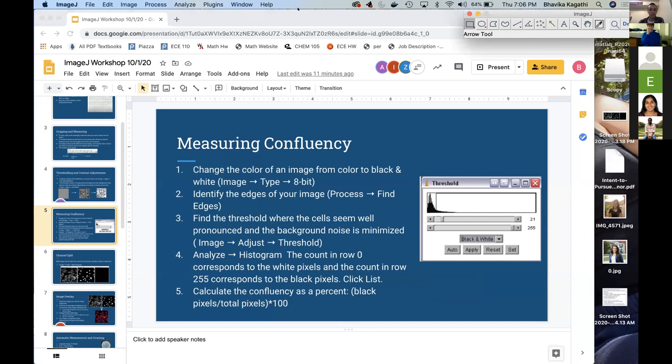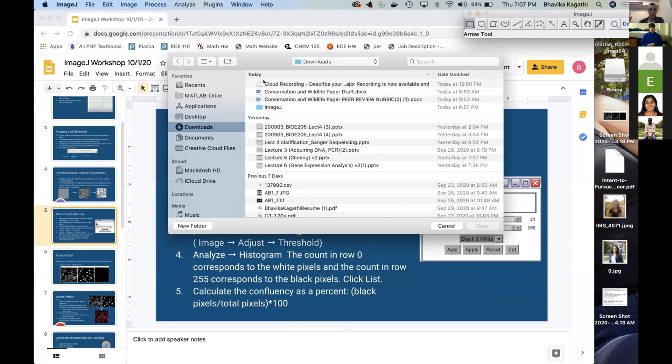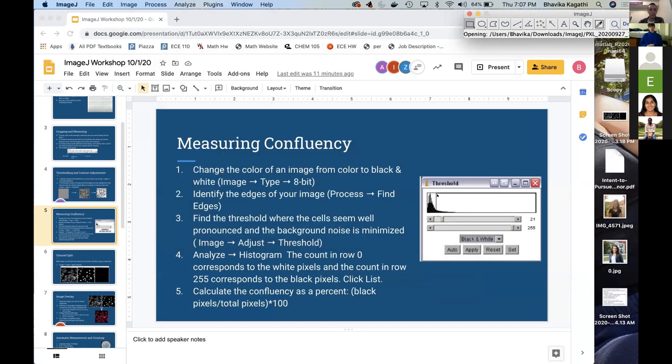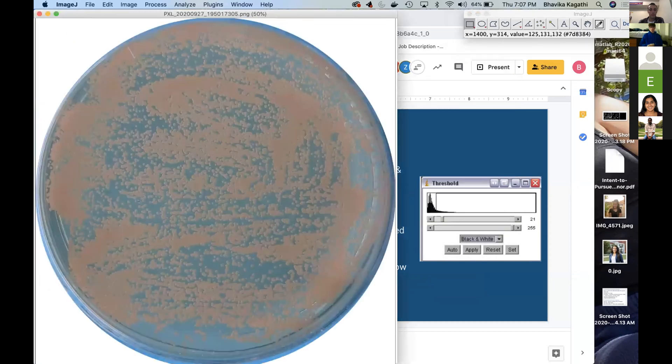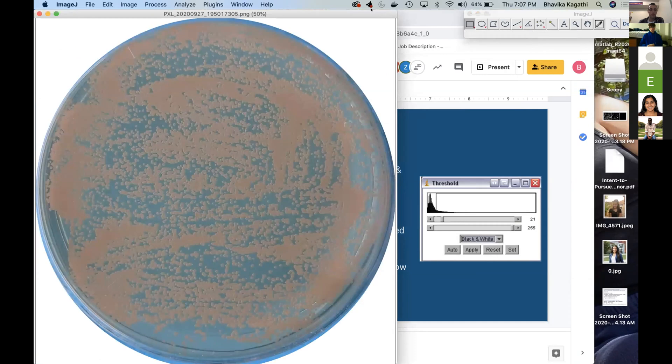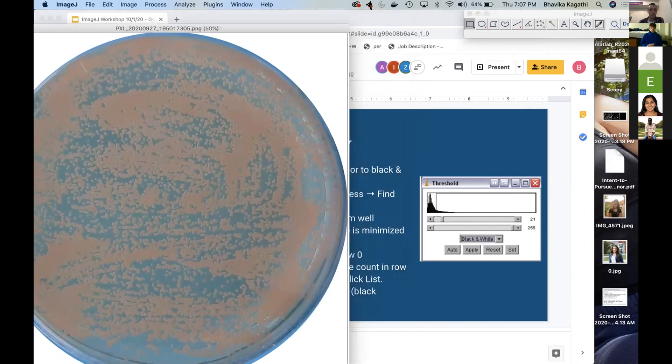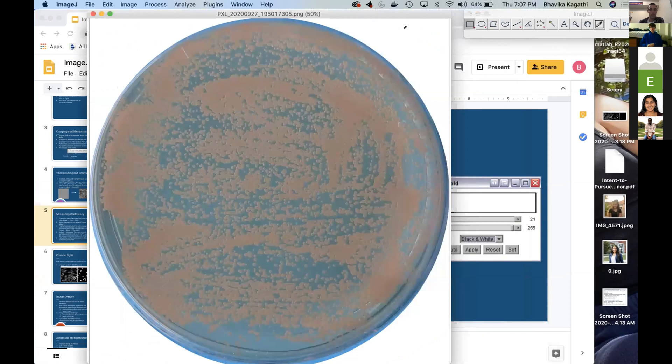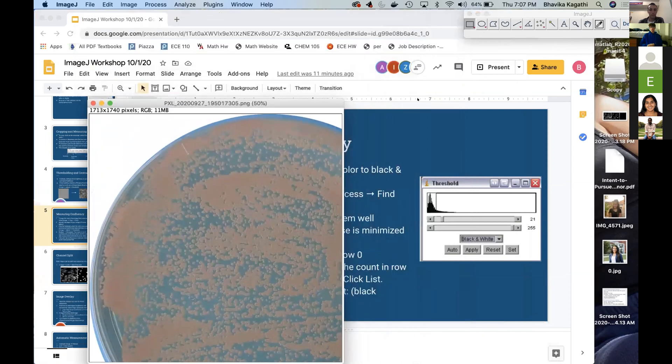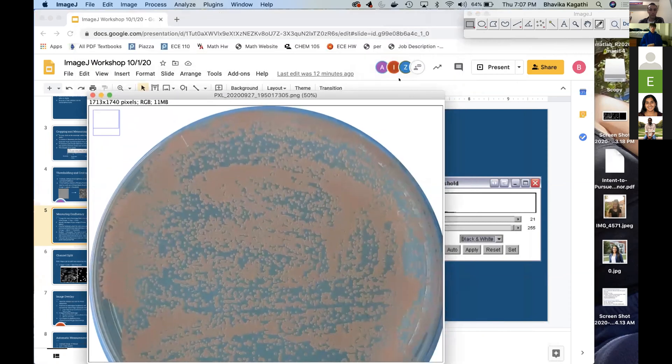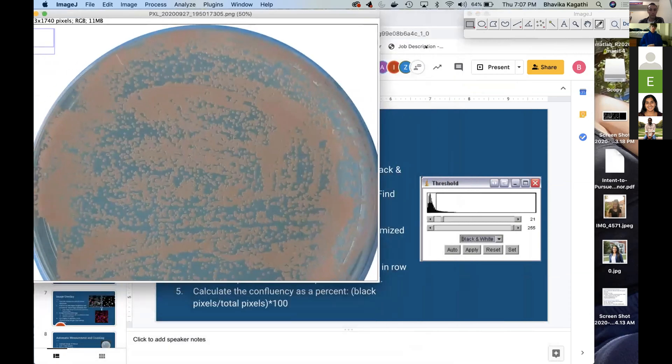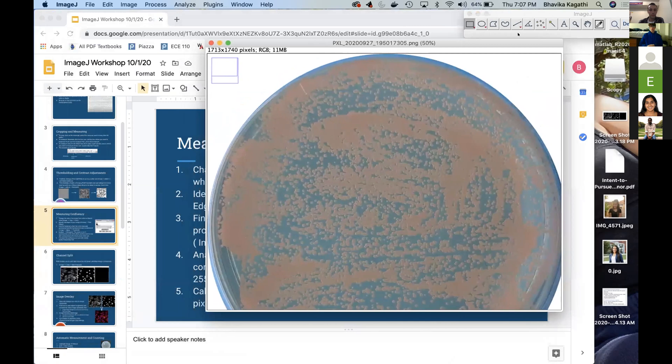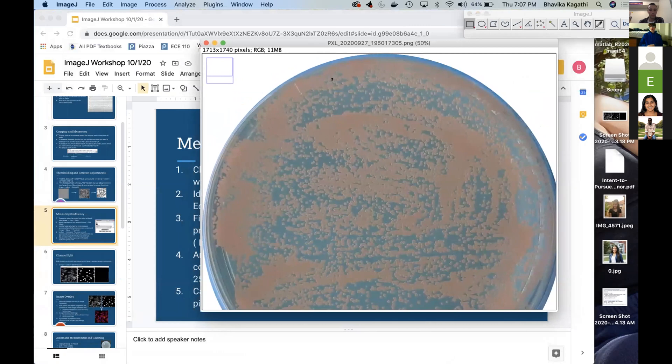So first we're going to start with File, Open, Image. Here I just have a plate which has a ton of cells on it. The first thing you want to do is make this black and white.